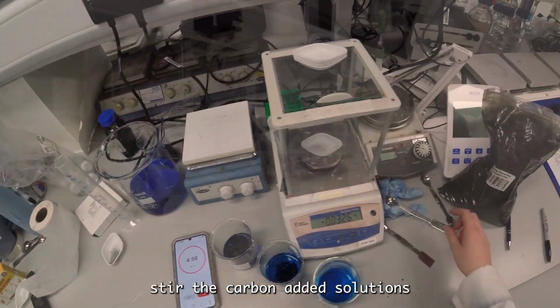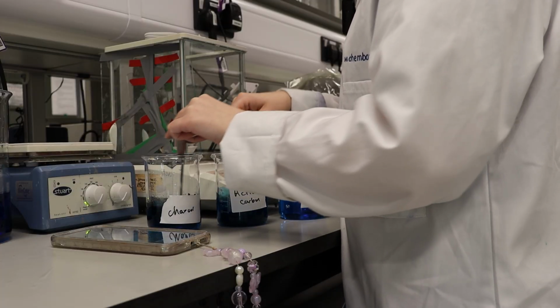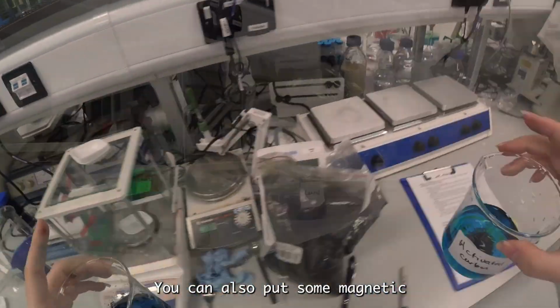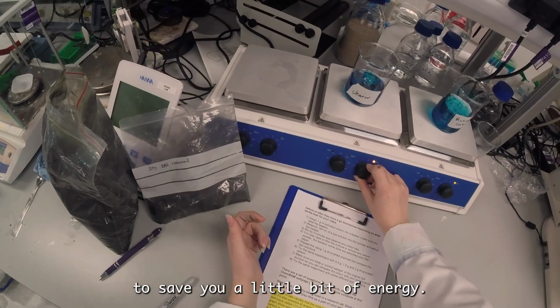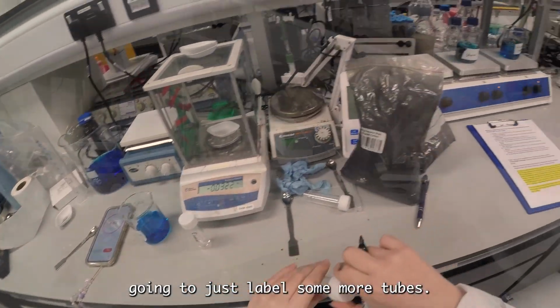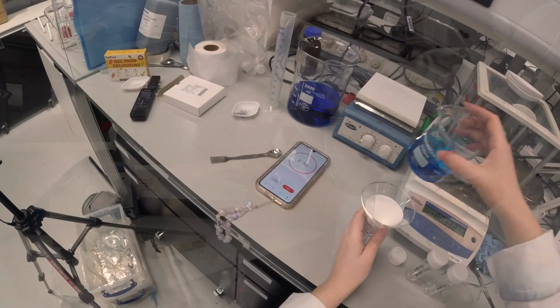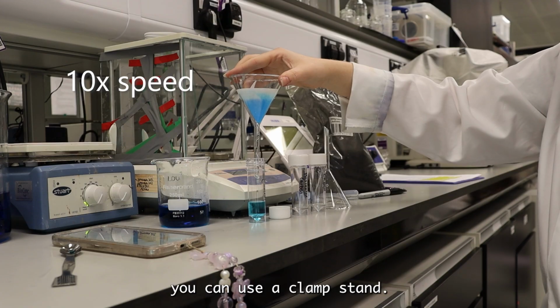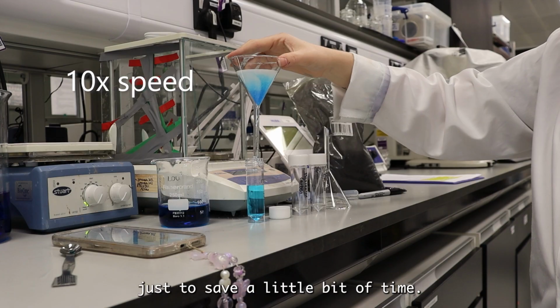I'm now going to stir the carbon added solutions for 5 minutes. You can also put some magnetic stirring rods in these and add them to a magnetic stirrer to save you a little bit of energy. While that continues stirring, I'm going to just label some more tubes. Also, while I'm waiting, I'm just going to filter my control. So if you don't want to hold this, you can use a clamp stand, and I also don't filter the full 100 milliliters just to save a little bit of time.